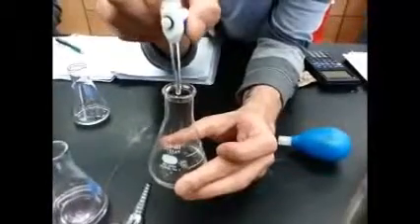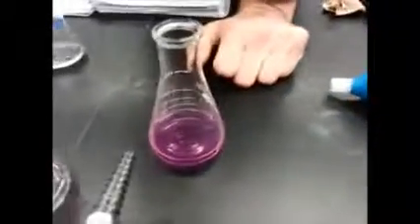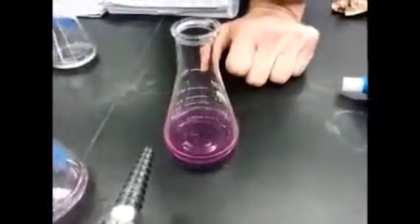Here we see the pink as the standard solution is entering the analyte. Continue to swirl it so that we can mix it up well. Here, persistent pink has been reached, so we will stop the titration. This is reading his final volume. The final volume is 32.49.